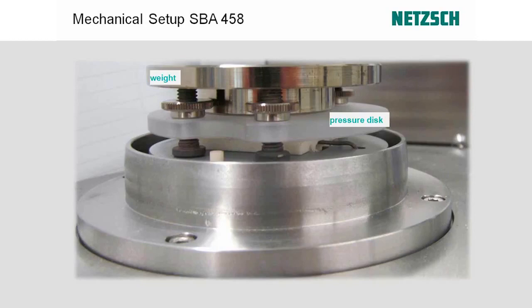So we want to have a constant force pressing down on the sample to maintain the contact between the sample and the 4 pins on the bottom. And again, those pins are mounted on springs so that we are compressing the spring to provide that constant force to achieve uniform and repeatable contact with the sample.